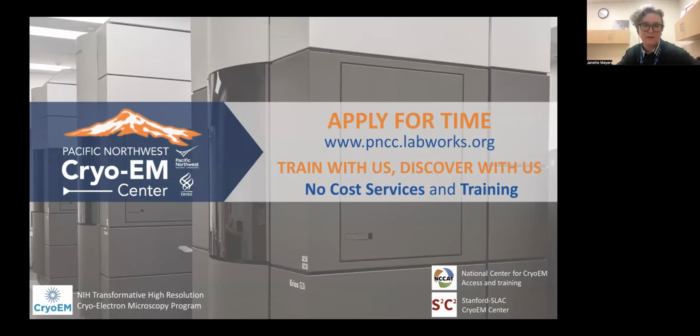If you have a general access proposal, you can also come to our training workshops and things of that nature, which cover sample preparation through data processing. Your proposal will also be assigned a scientific point of contact, or SPOC, which is my position, who can answer your questions about sample optimization, data collection strategies, etc.